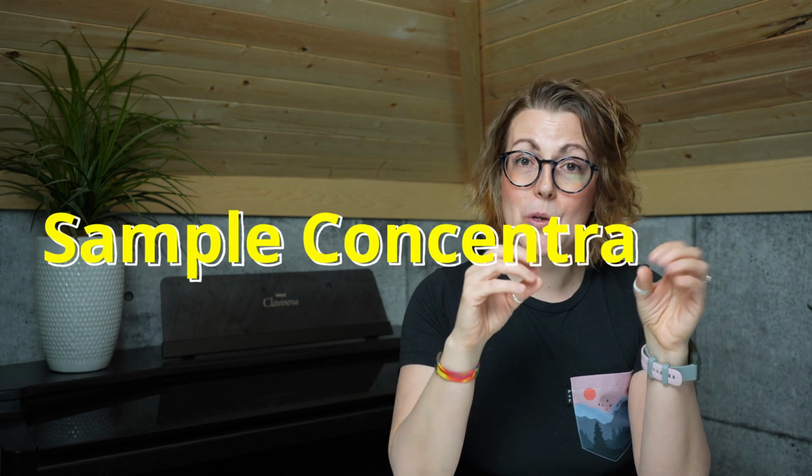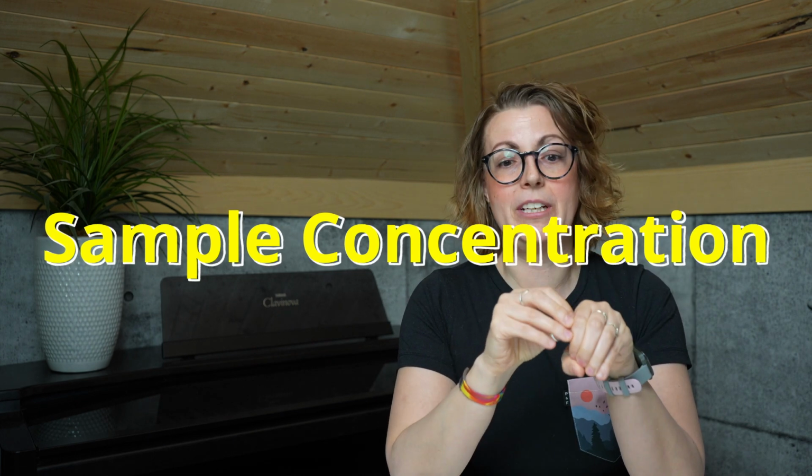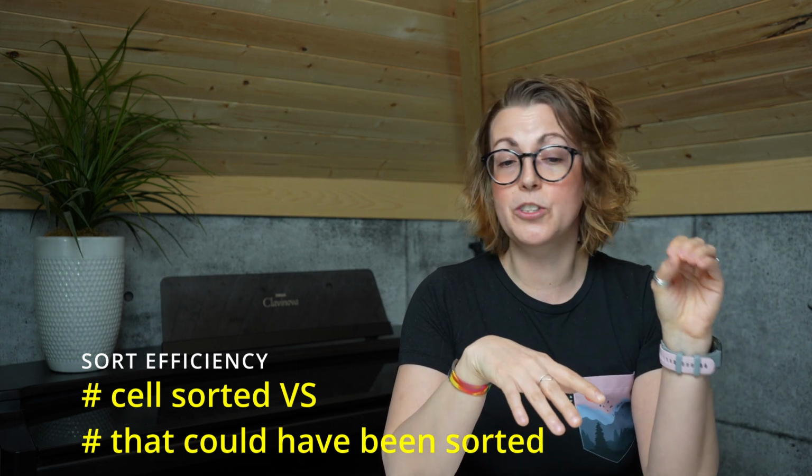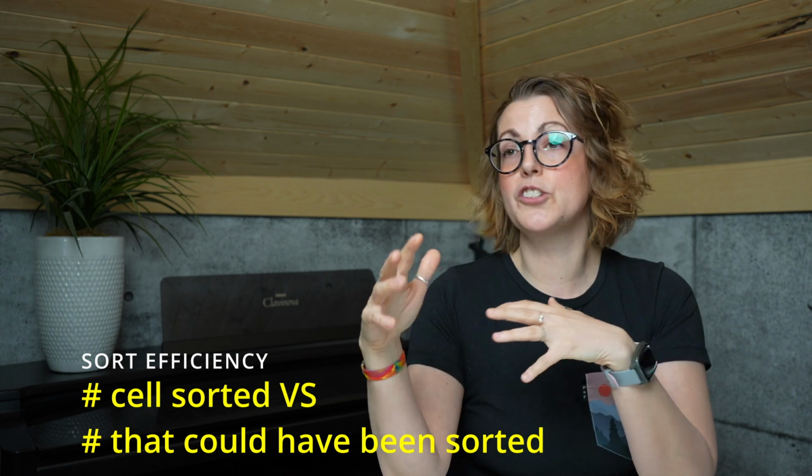Sample concentration is also a really important factor in determining your sort outcomes. A sample that is too concentrated will have an increased number of aborts, resulting in a lower sort efficiency. So when I talk about sort efficiency, what this means is counting or measuring the number of cells that were sorted compared to how many cells could have been sorted. So if someone says their sort efficiency was 80%, that means 80% of the sortable cells were sorted, whereas 20% were lost as aborts.